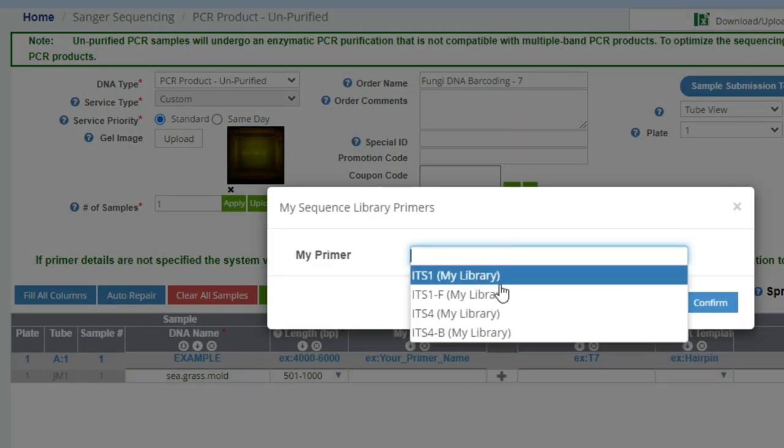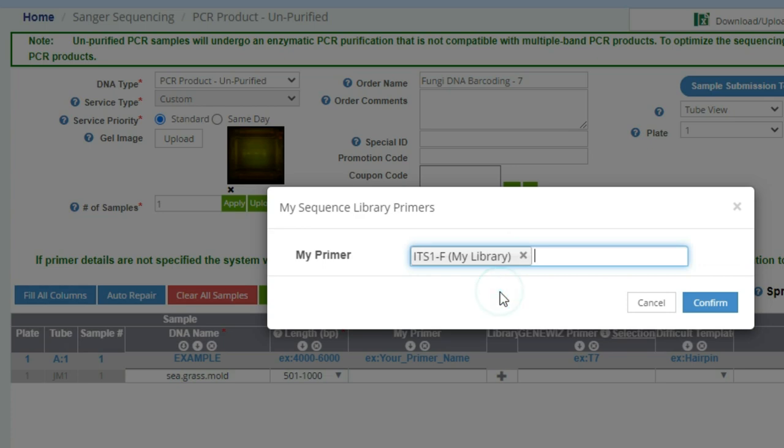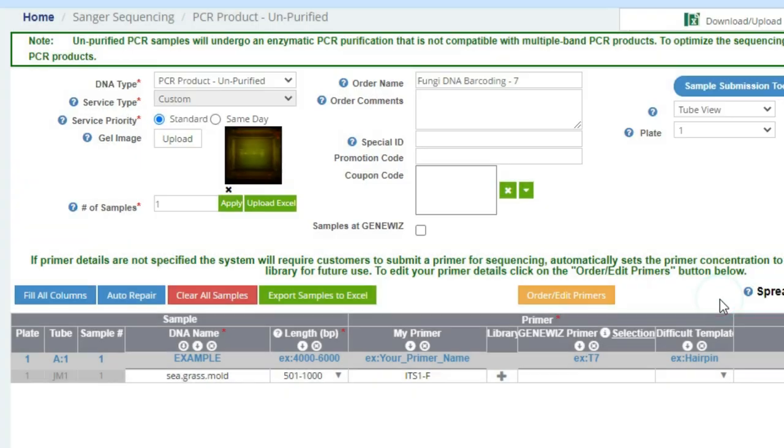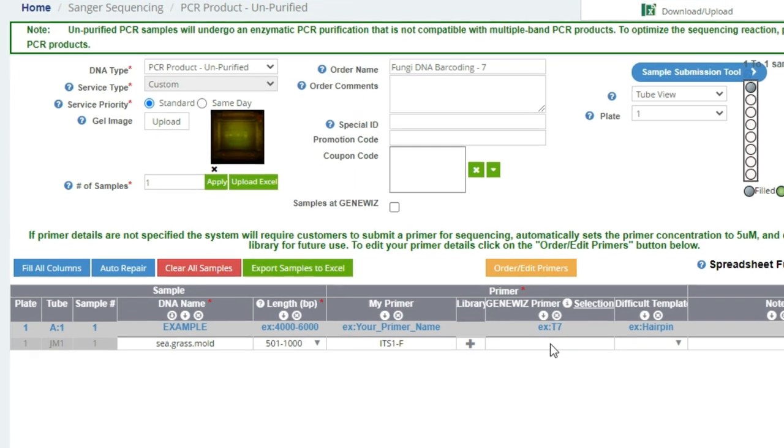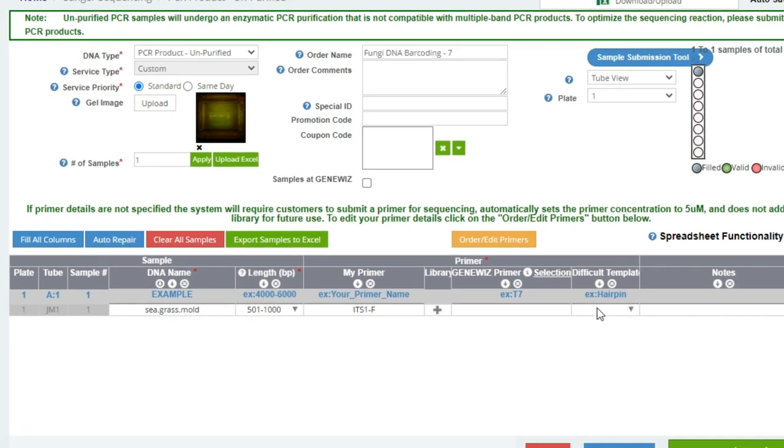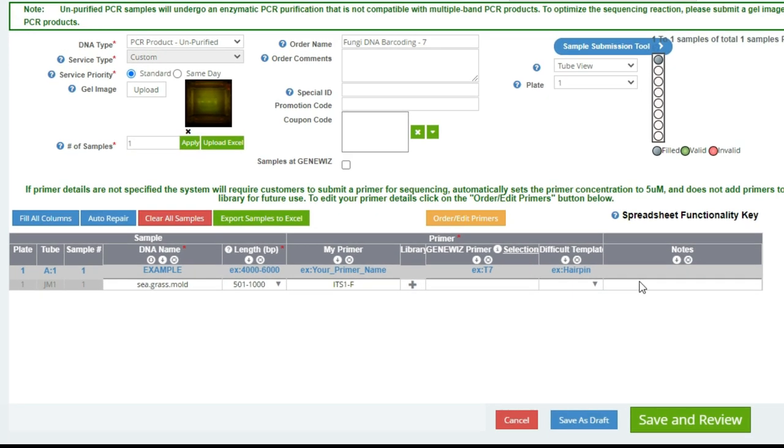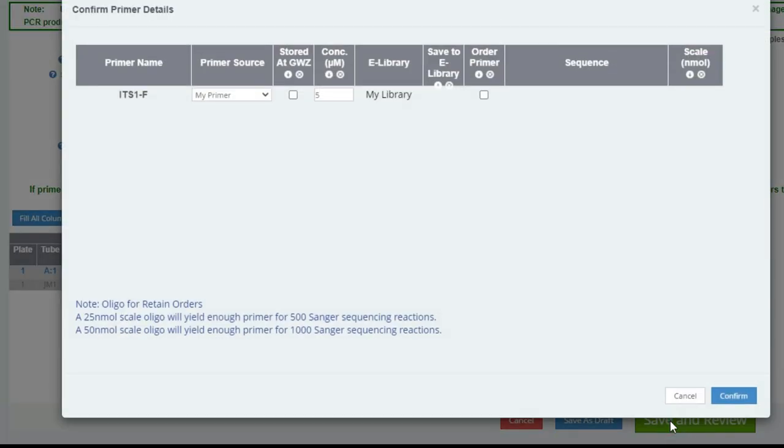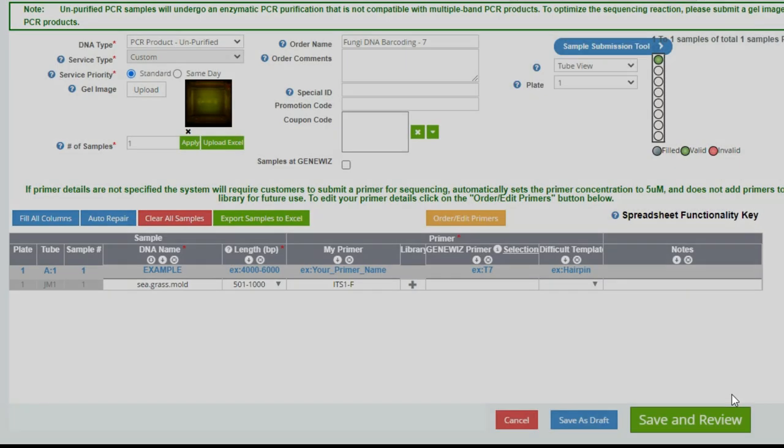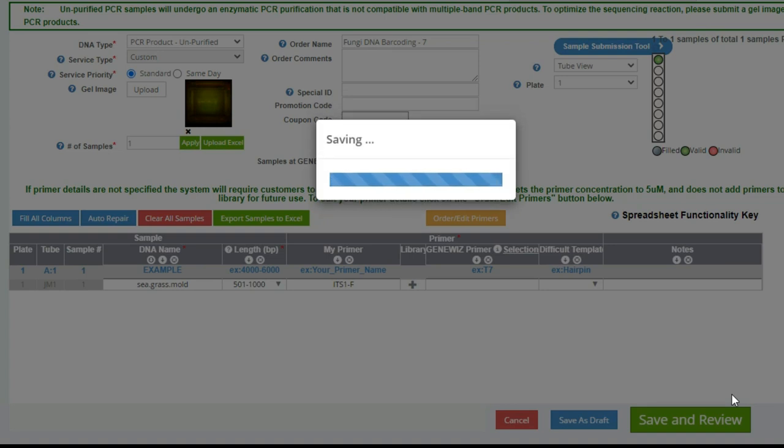We're going to do a forward read, so we're going to select the ITS-1F primer. The primer, by the way, when I ordered it from GeneWiz, there was an option to pay a little extra and have them keep some on file so that I don't have to send any in. And so that's why when I order, I can come and check this stored at GeneWiz button because they actually have some of my primer on file. It just saves me a step for when I want to sequence.